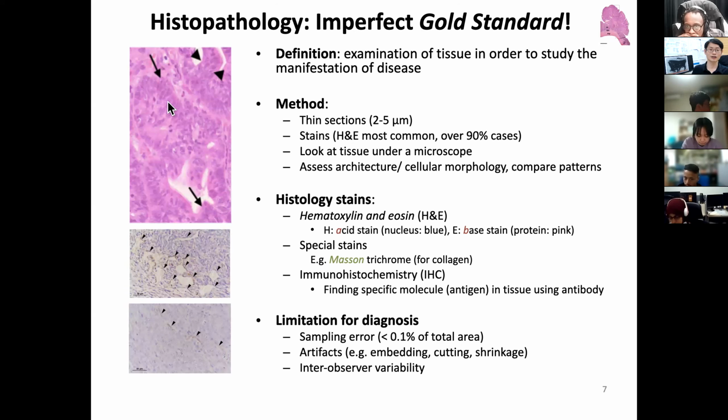So this one is actually my sample. When I was a postdoc, I was doing colon cancer research. So these are colon cancer models from mouse. And look at these: the colon pits are a little bit irregular, and you see the nuclei are bigger and the morphology is not clean. So these areas of arrows indicate there is something going on, a tumor process.